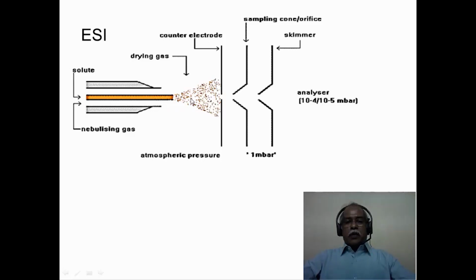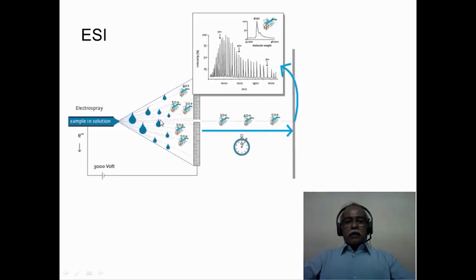And in the fine spray that is produced here, the droplets are formed, and because of the nebulizing gas, the droplets undergo slow evaporation of the solvent until the solvent molecules are completely evaporated and only the solute molecule in the gas phase is obtained. In doing so, the solute molecules also acquire charges, typically represented as 30 positive charge, 40 positive charge, 50 positive charge, and so on. Depending upon the kind of molecule that we are dealing with, how many basic sites are there, that many protonations can take place, and such large charged molecular systems can be obtained in the electrospray ionization mass spectrometer.